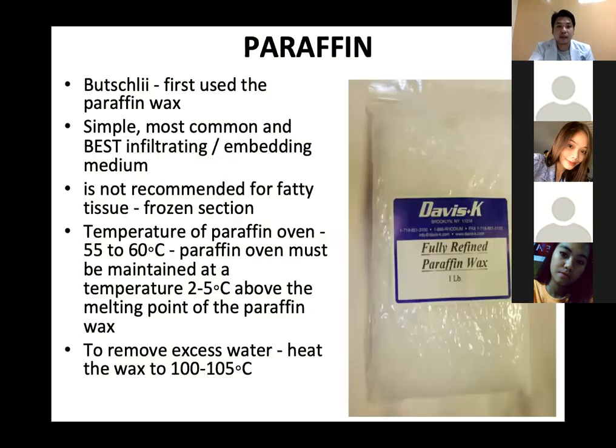What is the most common impregnating medium? The most common is paraffin wax. Otto Bütschli was the first one to use paraffin wax. He was a Japanese, class, and I think you're familiar with him, since Iodamoeba bütschlii was named after him.